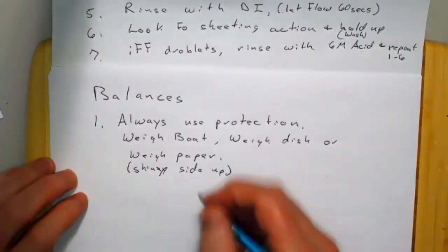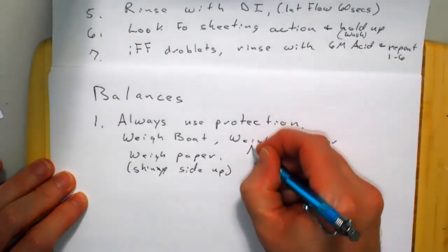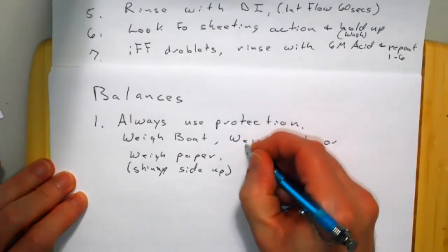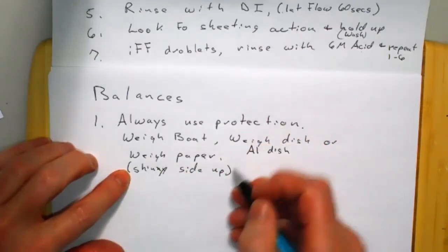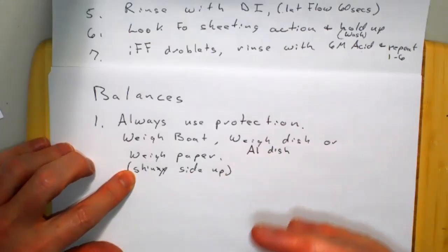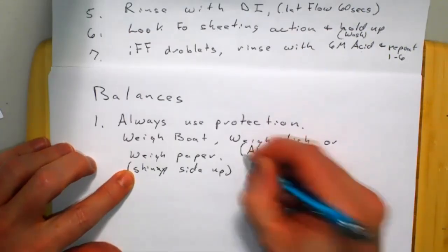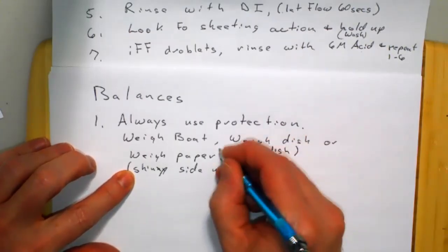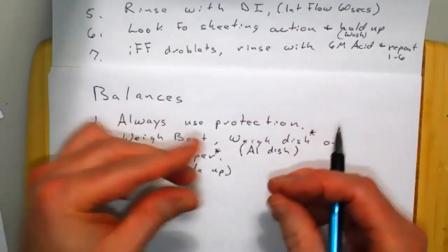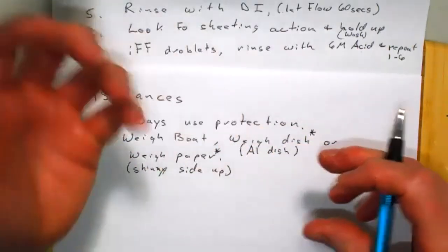Okay. Then let's go to a weigh dish, which is an aluminum dish. I said weigh paper is probably your best bet because it's a low mass, and so most of the mass on the balance pan is your material. Well, an aluminum dish isn't much either, so I like that bad boy right there too. And the aluminum dish, I put a little pour spout in. It's a round dish, so it's a little hard for me to pour out of it.